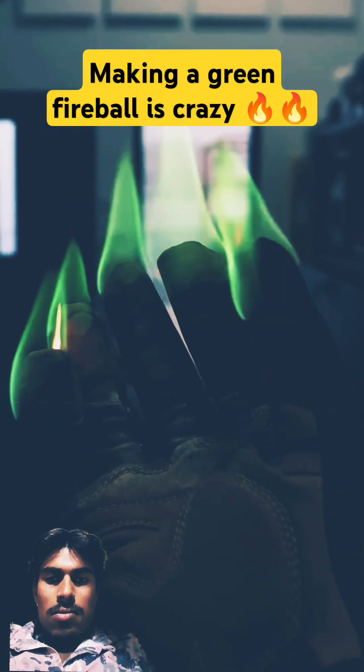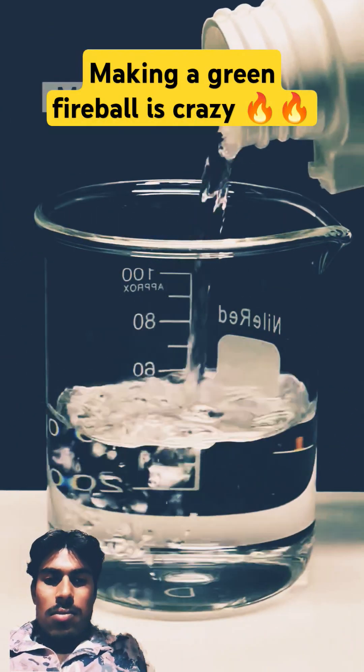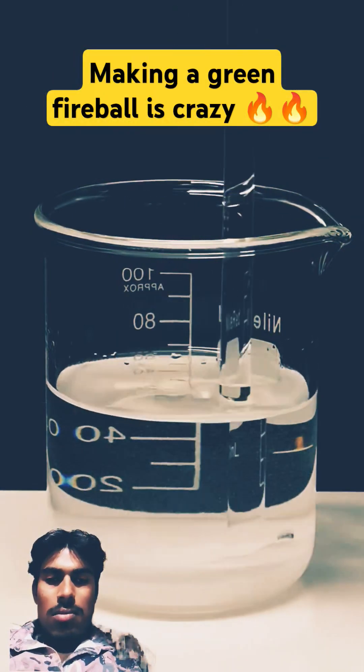Today, I'm going to be making a fireball. To make this happen, the first thing that I need is some methanol. Then, I'll add some boric acid, and I'll stir it until it all dissolves.